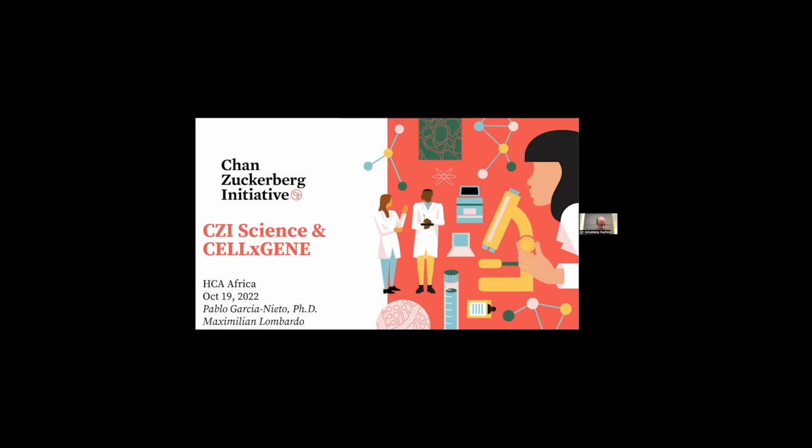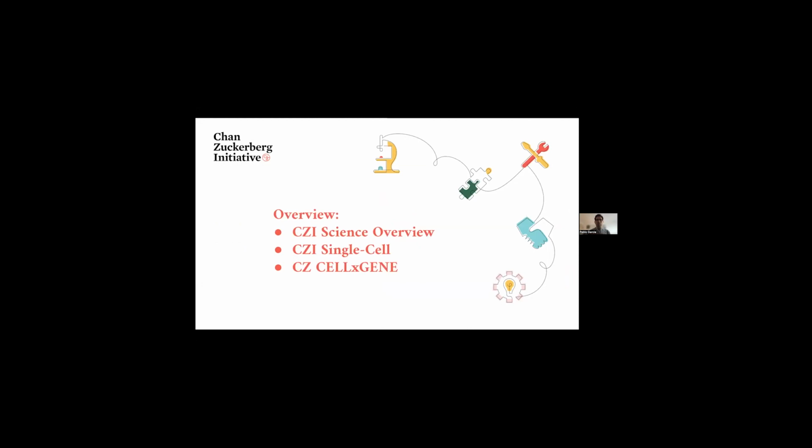Yes, everything's good. Perfect. Okay, as I said, we're coming from the Chan Zuckerberg Initiative, specifically from the science initiative. There's also an education initiative, and we're going to be talking a little bit about what we do in the initiative, and then we're going to be talking about this piece of software called CELLxGENE. I'm Pablo Garcia. I'm a computational biologist, and we have Max here as well. He works on the product side, and he'll be doing part of the demo as well. I'm going to go over what we do in the science overview, and then specifically about what we do in the single cell team, and then going into the bulk of the presentation, which is how to use this software called CELLxGENE.